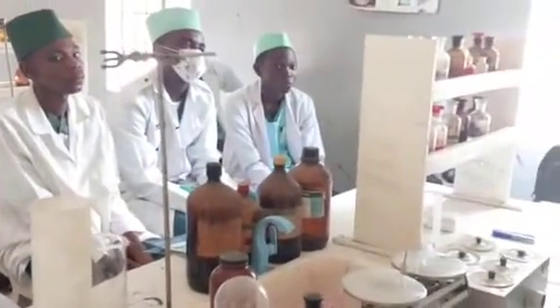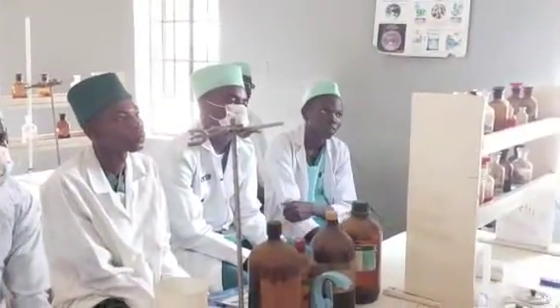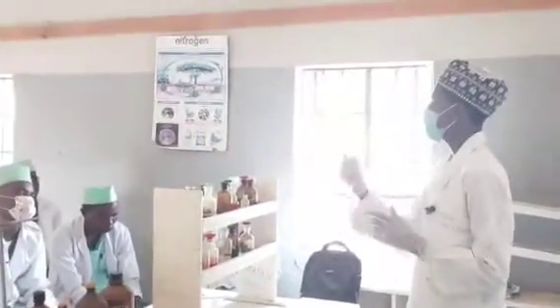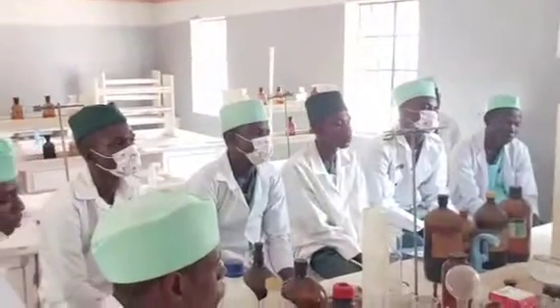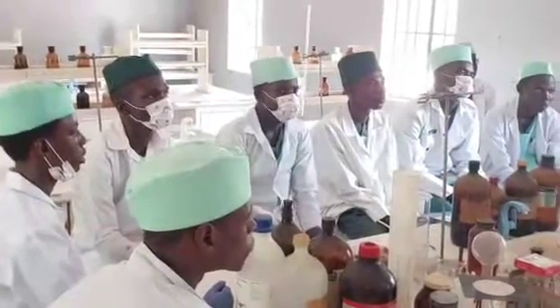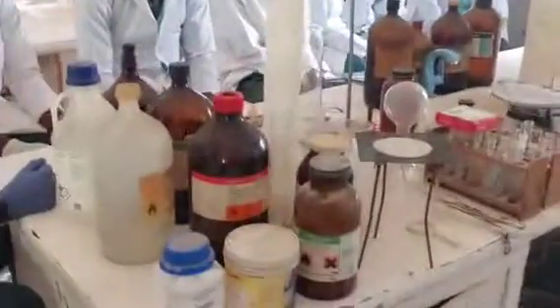Should not be introduced to the lab. You cannot say, okay, I'm in the lab as a researcher, I want to eat in the lab. It is dangerous because there are some gases that tend to move and maybe they will contaminate your food, causing some health hazard. And last but not the least, never use glasswares for eating or drinking purposes.